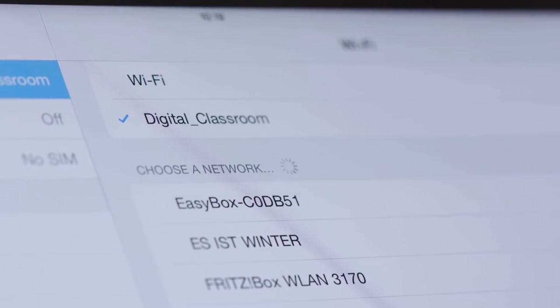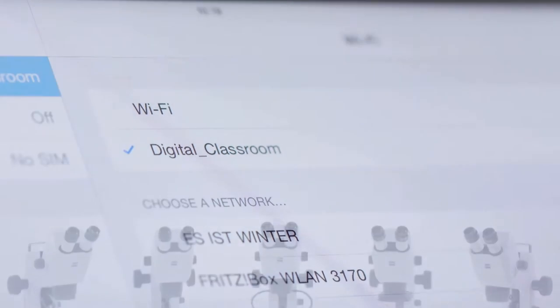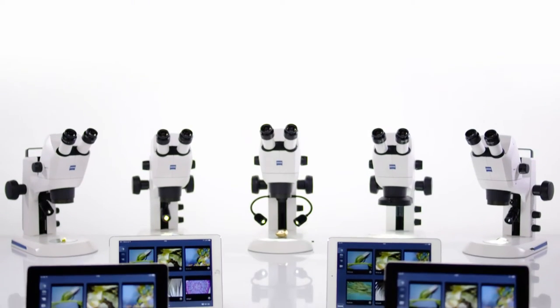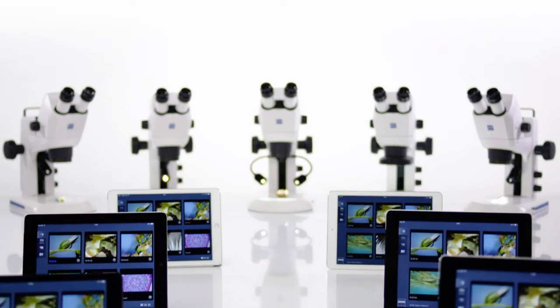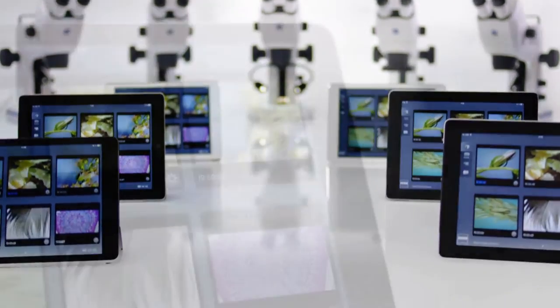Simply create your own digital classroom by connecting up to 10 STEMI 305 Cam and 10 iPads to any existing Wi-Fi.